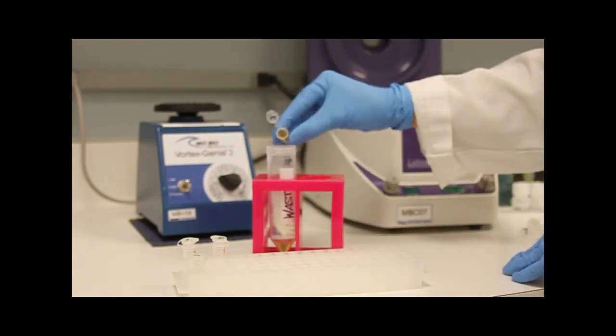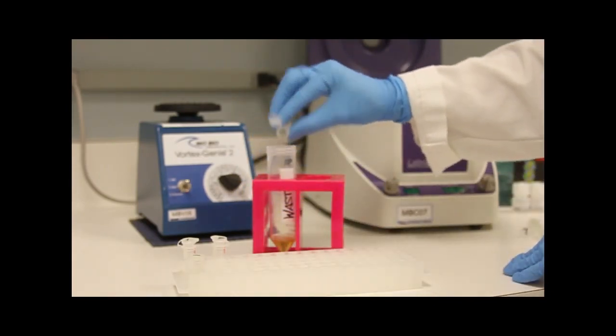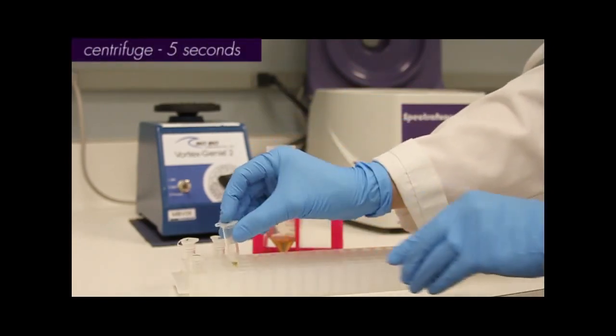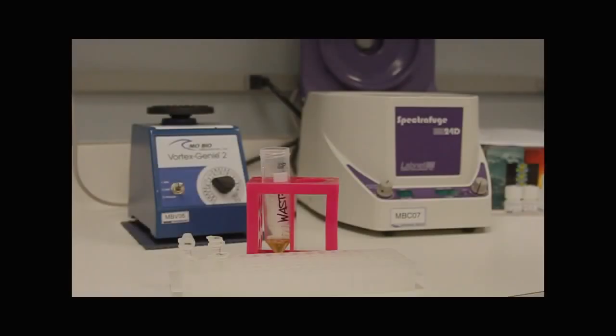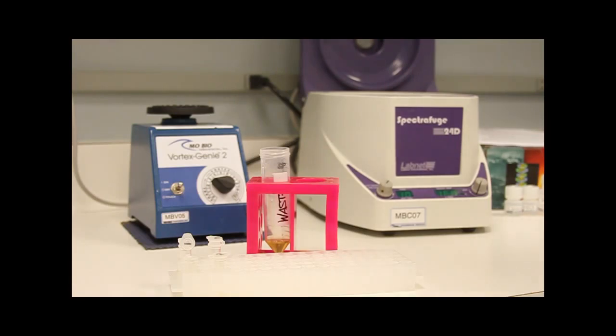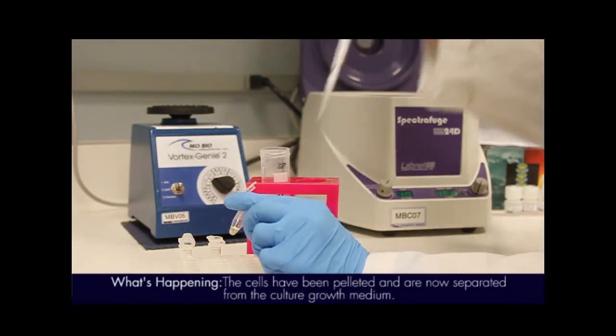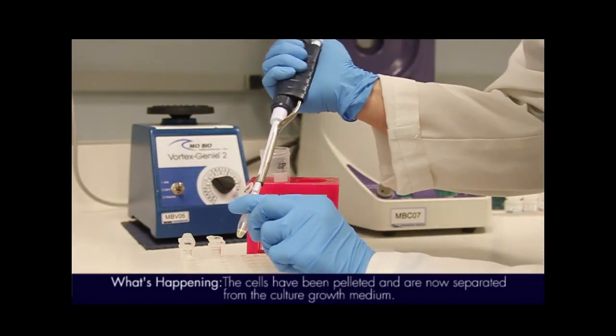Once all of the culture has been pelleted, centrifuge for 5 seconds at 16,000 times G to remove all traces of liquid from the sides of the tube. Remove all visible liquid with a narrow pipette tip. Removing all liquid at this step is critical. Using a small bore pipette tip helps remove all traces of liquid media.